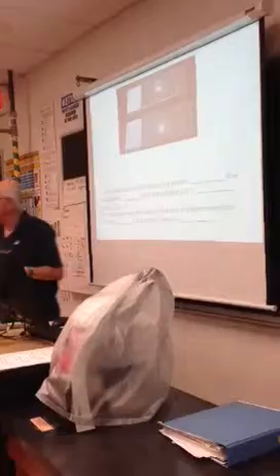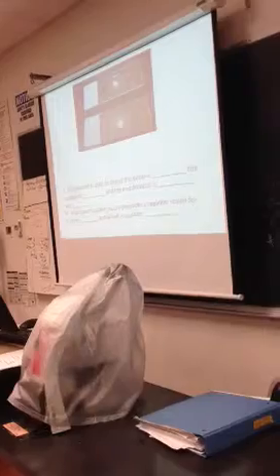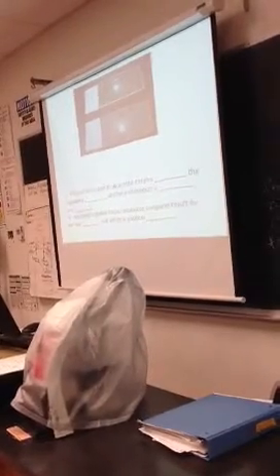Okay, catalase test. Some of you didn't see it, but some of you did, and we'll do it again later on. This is a slide test, but you can also do it on a plate if you throw your plate away in the end, okay? What you're looking for is the enzyme catalase. How do you spell it? C-A-T-A-L-A-S-E. An S, not a C. Catalase. And what's the substrate?